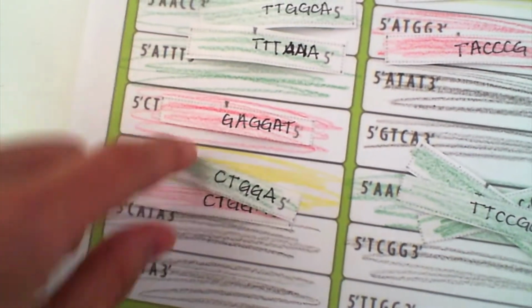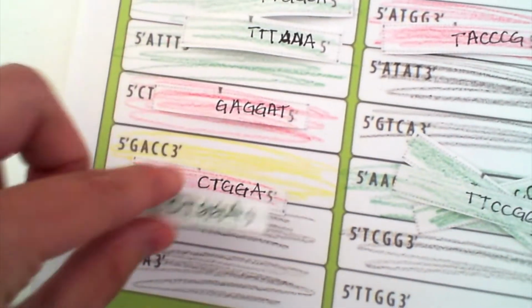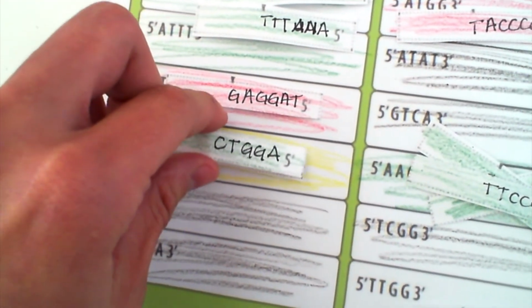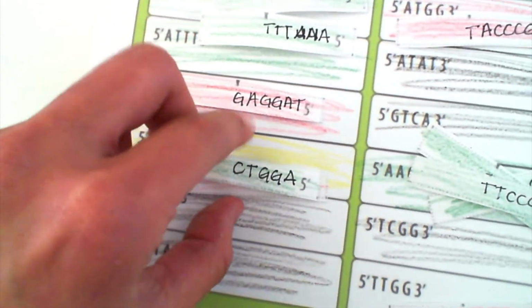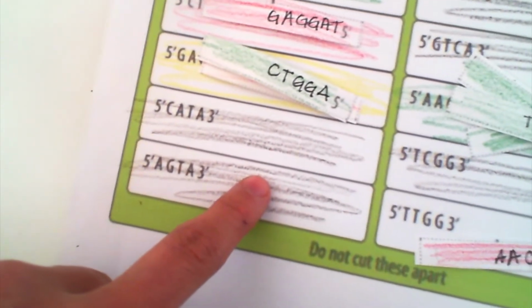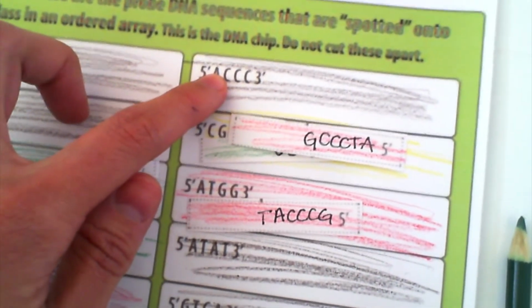In this one, there is one green cDNA and one red cDNA, which, given the fluorescent light, is going to shine yellow, meaning that in the plant with light and the plant with no light, they were expressed equally and are working exactly the same. This gene, not expressed. This gene, not expressed. Moving over here, black, gene not expressed.